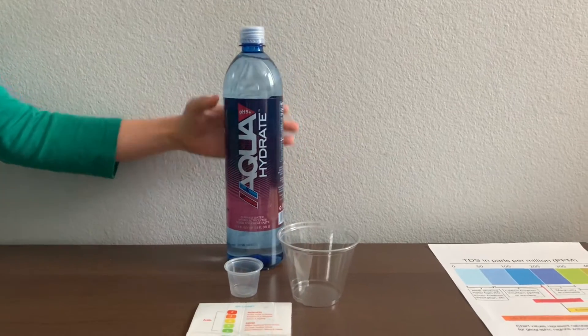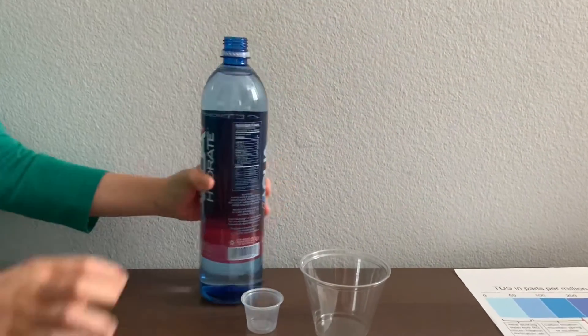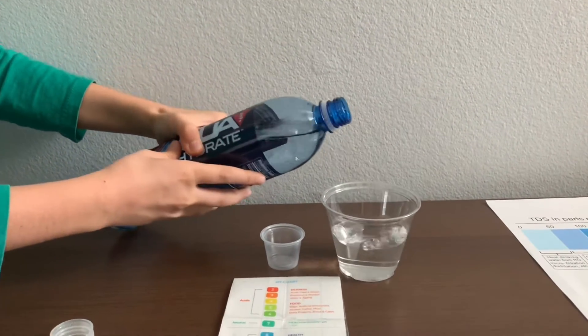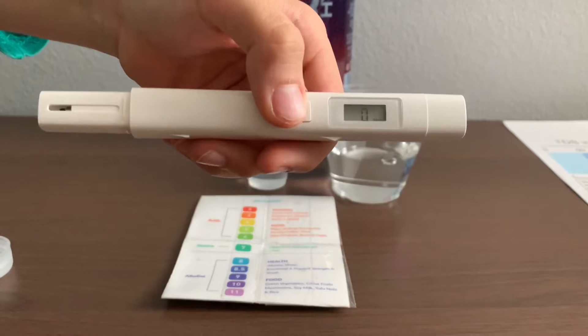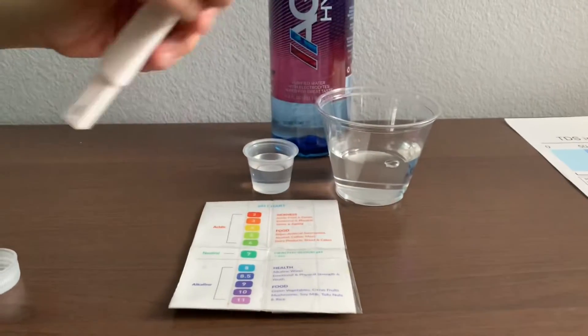Let's test the pH and TDS levels. Let's pour some water in. First, let's test the TDS level. Turn on the TDS tester, make sure it says zero, and put it in.